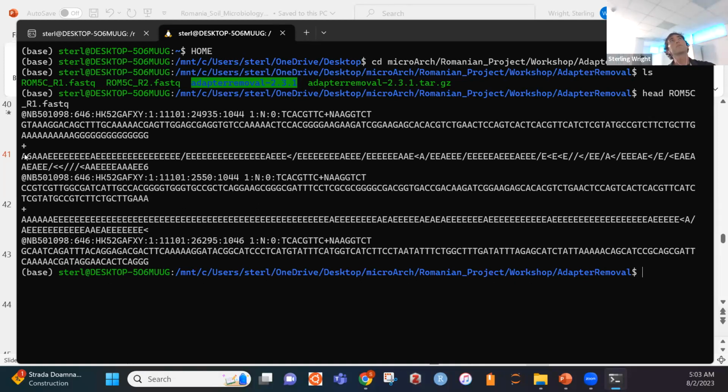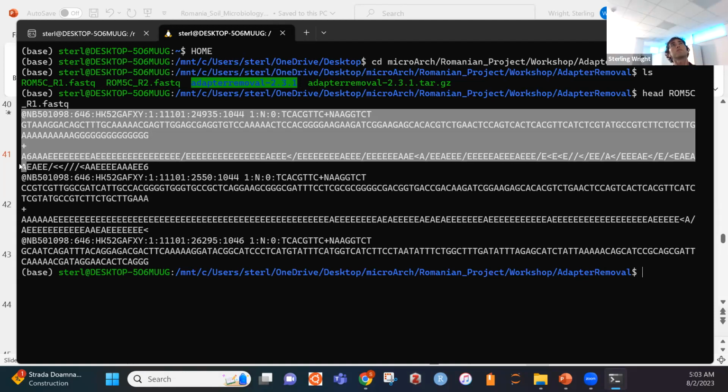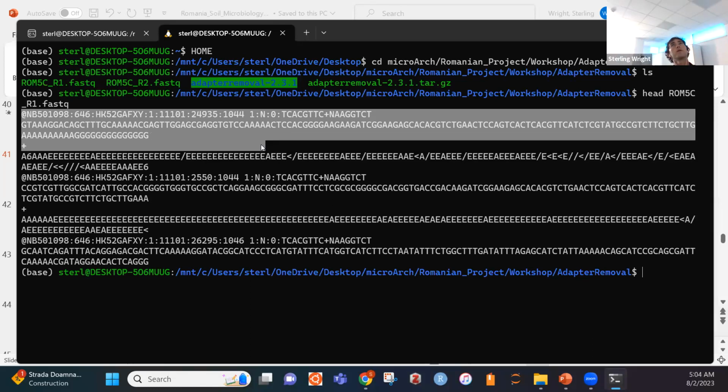And then we have the separator, and then all the quality scores corresponding to each nucleotide, the confidence score for each nucleotide. So that's one read. This is for one DNA sequence read that we're able to generate.